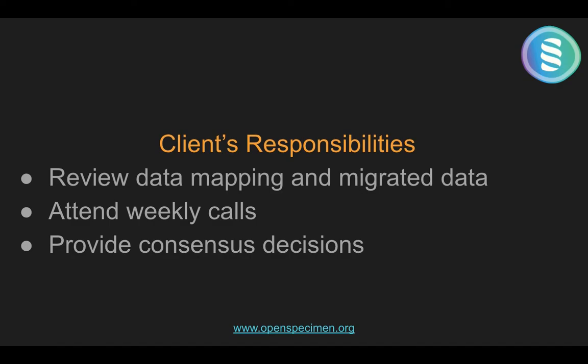Now we expect you to do three primary activities. First is review data mapping and all the migrated data. So you have to be proactive and raise as many issues as possible. Secondly, we set up weekly sessions with you. So you have to come up on the calls, attend the calls. We will discuss the progress.